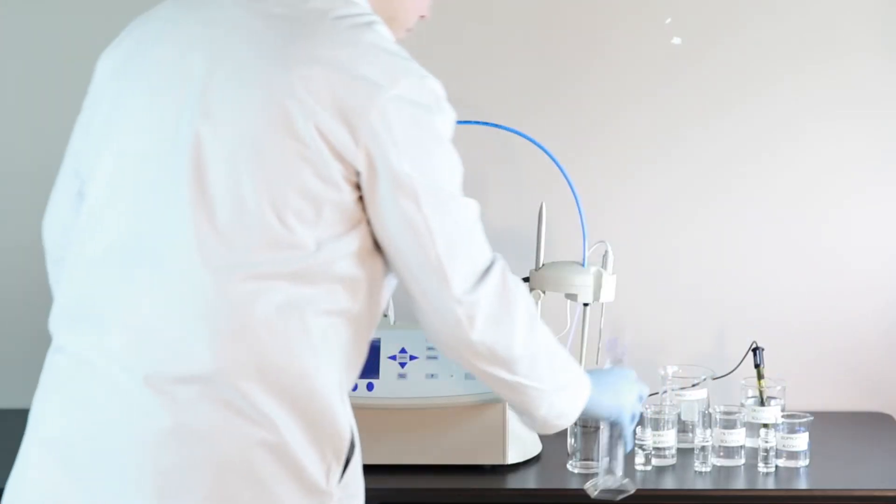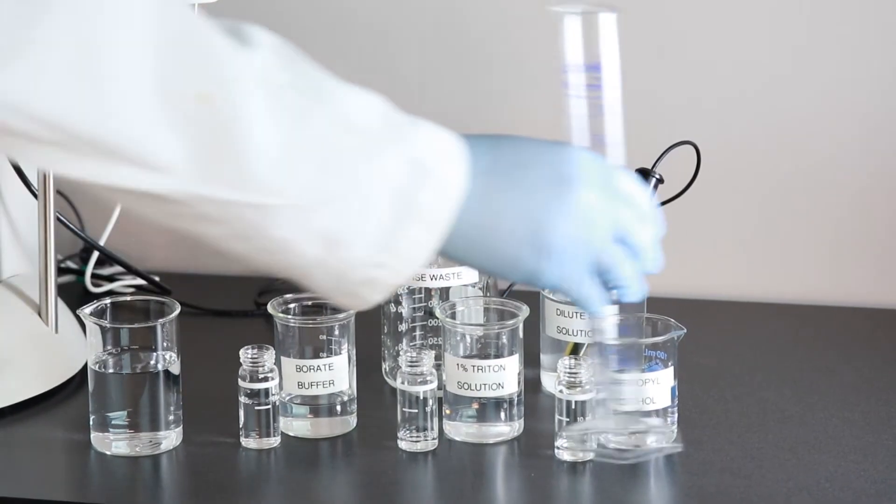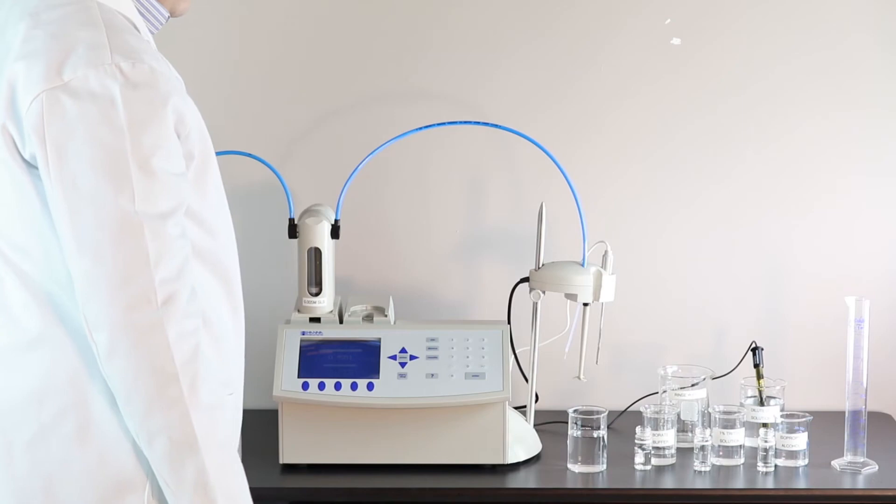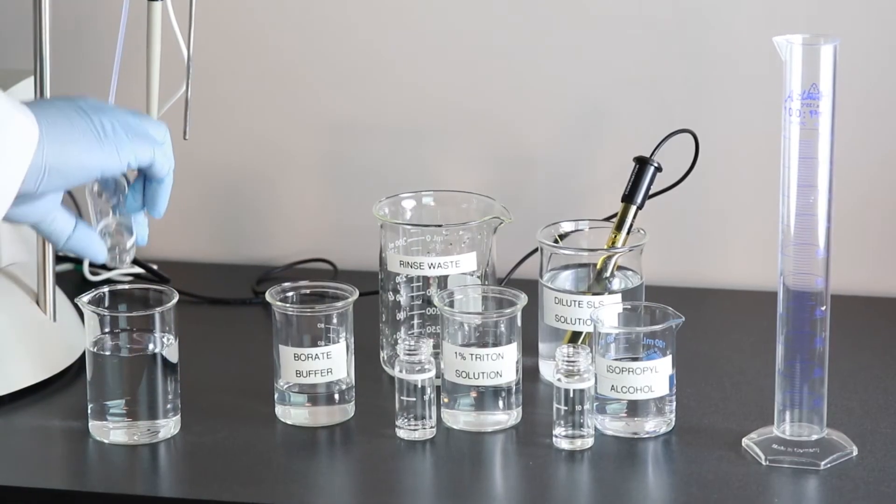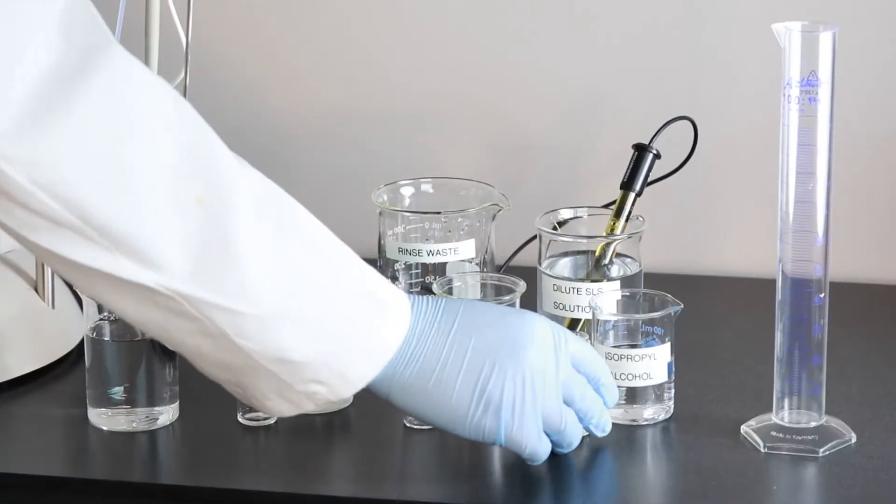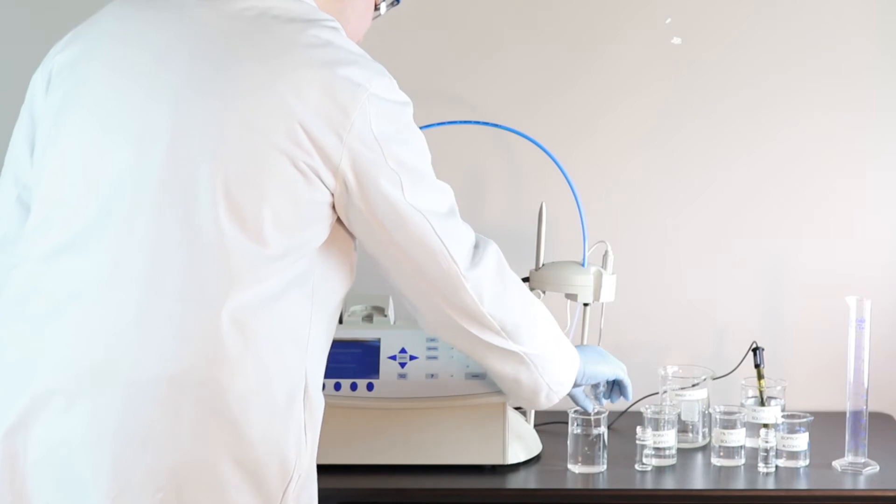I've already weighed out our surfactant sample into a beaker, and to that, we're going to add about 100 milliliters of deionized water. We want to make sure we have enough volume in the beaker to submerge our electrode. Now, I'll add 10 milliliters of pH-adjusted borate buffer solution, then 2 milliliters of isopropyl alcohol, and finally, 2 milliliters of 1% triton solution.